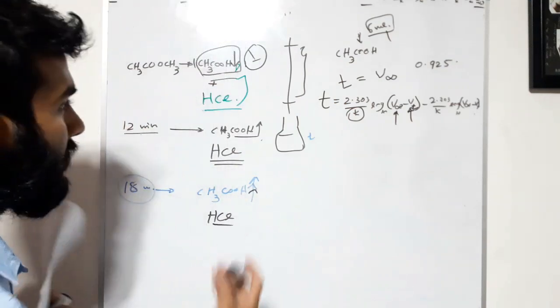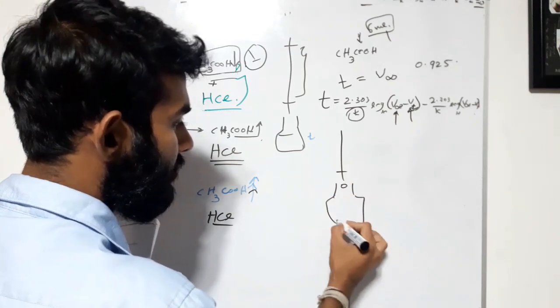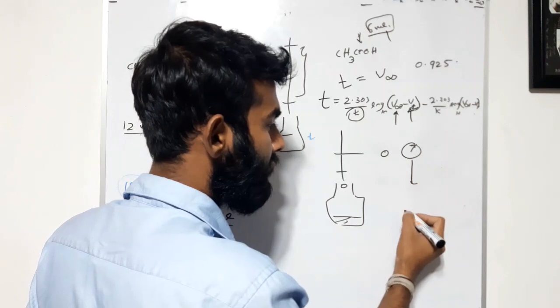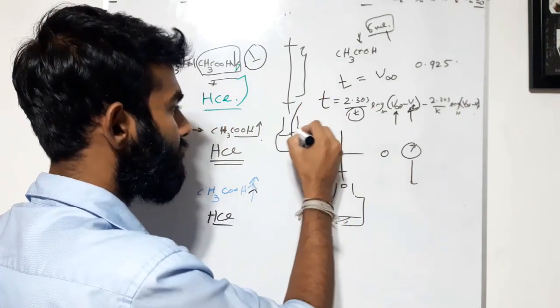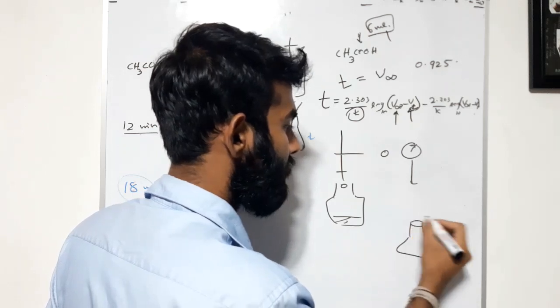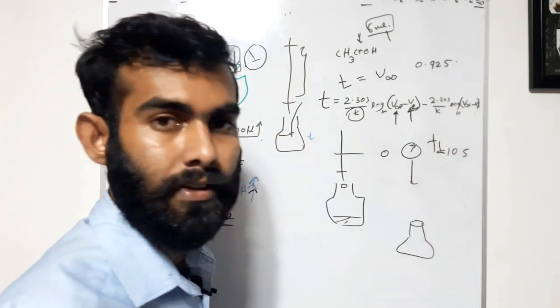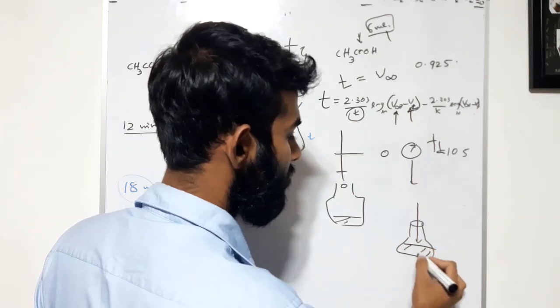So when we are adding methyl acetate into this reaction HCl solution, we are considering half of the draining time. Imagine it is 0 when we start the stopwatch at 0. Now time passing. We have to add extracted 5 ml of reaction mixture into ice. Consider the draining time Td is 10 seconds. We have to start the draining of reaction mixture after 6 minutes.